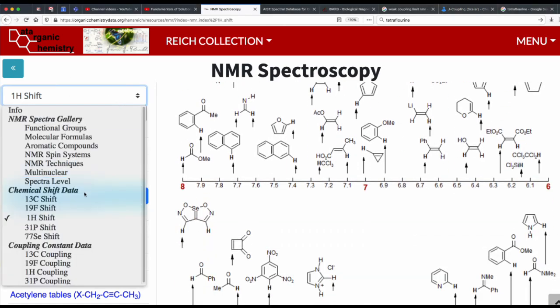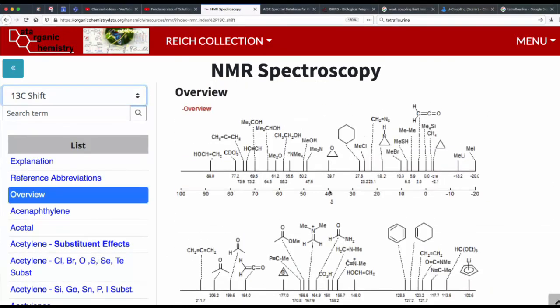Similarly, you can also choose the 13C shifts. You would be able to see here how spins that are present in different chemical moieties resonate at different frequencies, therefore making NMR an extremely powerful tool towards their analysis and characterization.